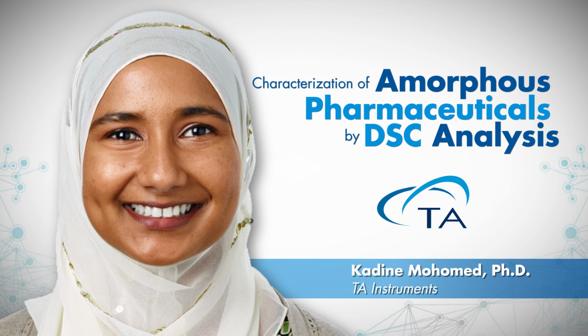So it boils down to, again, how do I increase the sensitivity in being able to detect a Tg, a very weak Tg? So going back to the heat flow rate equation, heat flow is equal to heat capacity multiplied by heating rate, which is where your Tg, your glass transition, will fall into. Increasing the heating rate and increasing the sample mass would be steps you can take as part of your experimental design.